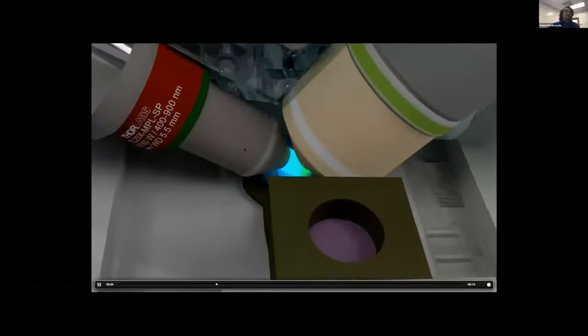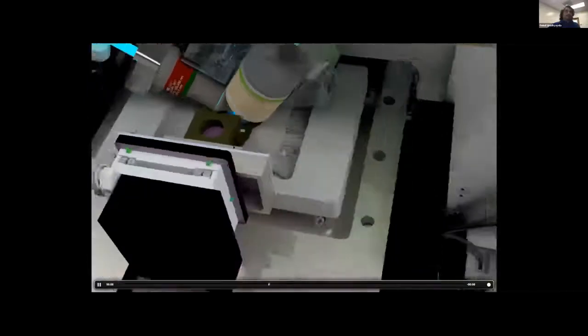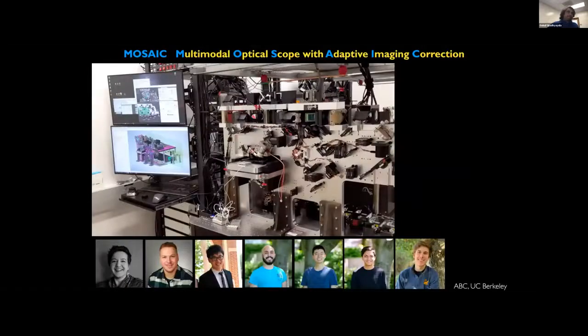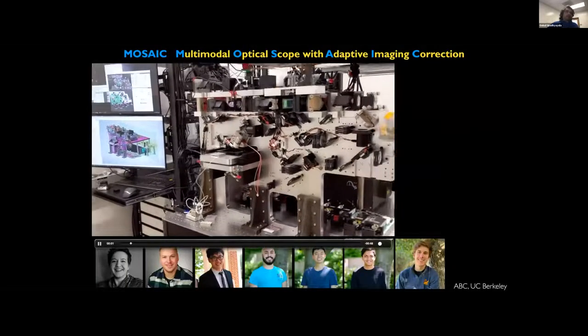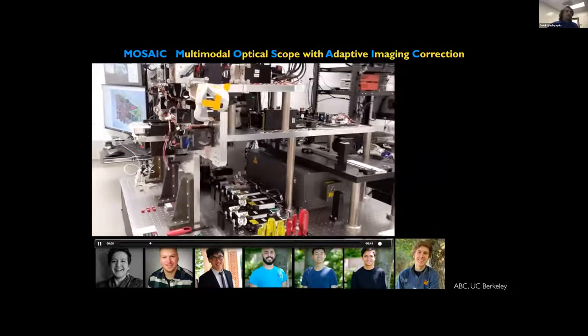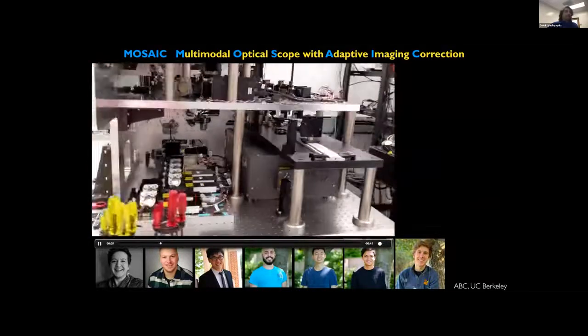So you have the light sheet configuration for the samples that are over there. You have the inverted objective. Again, these are all similar high-NA objectives. And then you have an upright station if you want to have a mouse or something that can use a lot of freedom below this particular station. So we built this at Berkeley. Again, amazing team here doing a lot of hard work. So we have 2 of these at Berkeley.